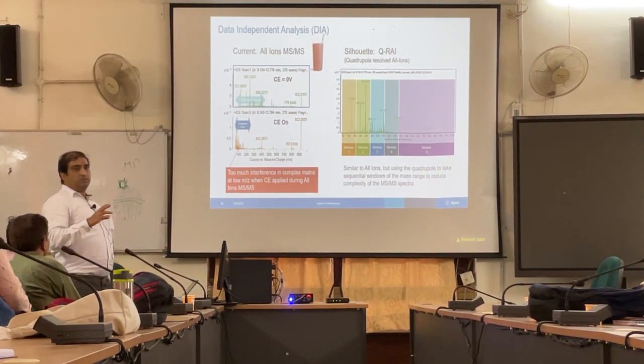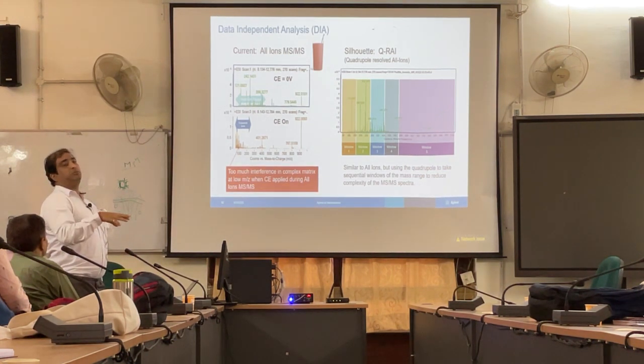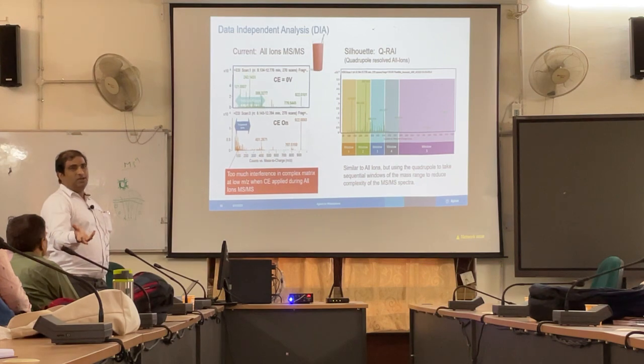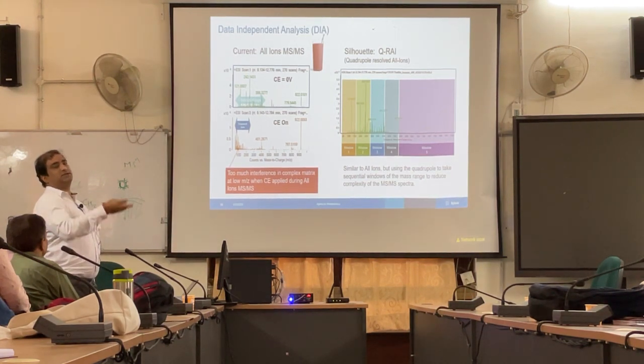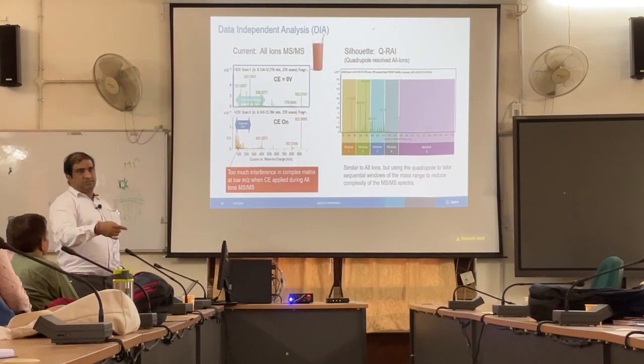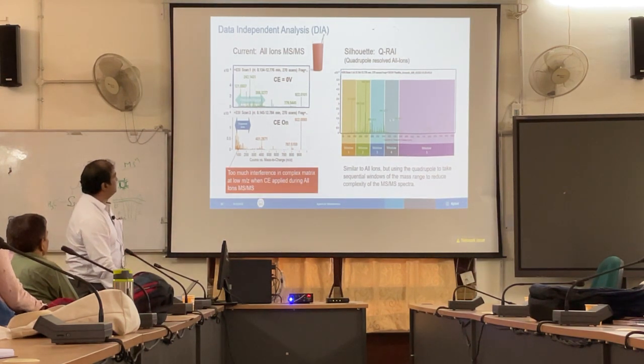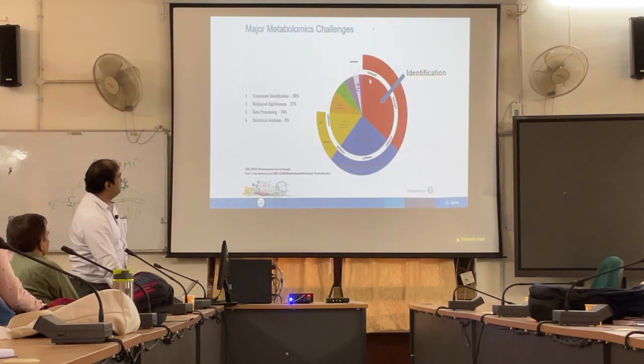The problem here, you will not get the molecular ion. But as I explained, molecular ion is not needed. You can go with fragment analysis and you can do the fragmentation practice. Because you have HRMS. So quadrupole is coupled to HRMS, that is the reason you can do this. Okay, so I will not go much into detail.